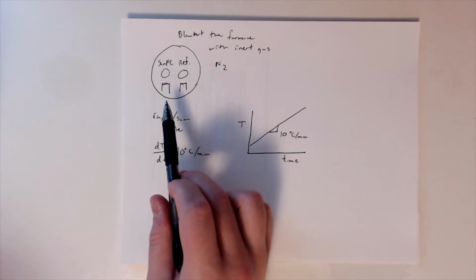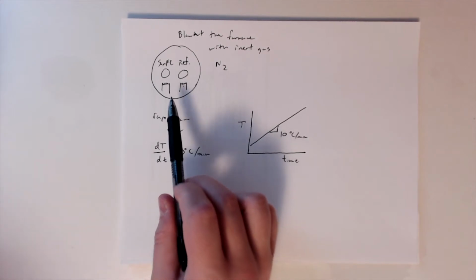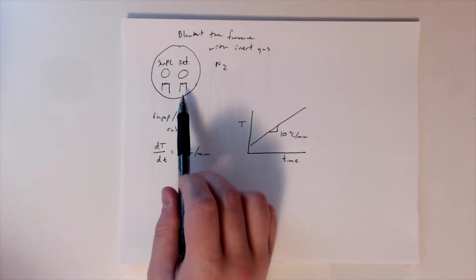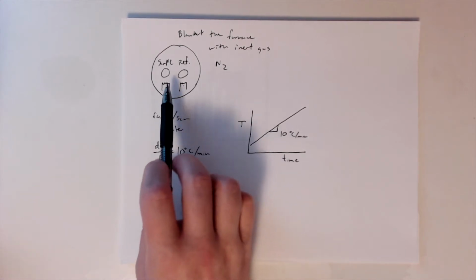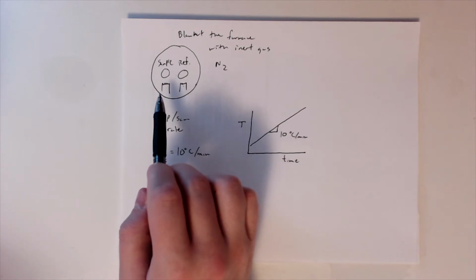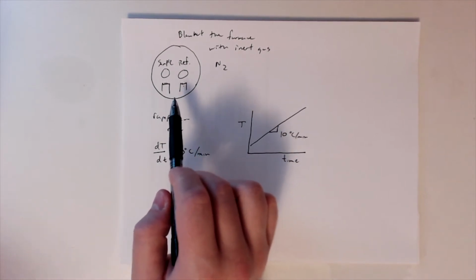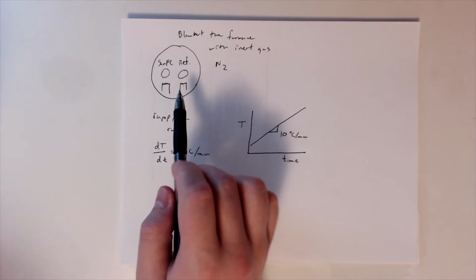And so we would see a blip, particularly a peak, on that curve, because more energy is going to the sample with the reference to the reference. Same thing if we have exothermic, but in this case it'd be the opposite direction, because energy is being produced by the sample, and therefore less power is being required to heat it up in the same way. And the same thing with the change, if material goes through a change in heat capacity, we also see a difference compared to the reference. That's why we need this to be something that is very benign, doesn't go into any thermal transitions.